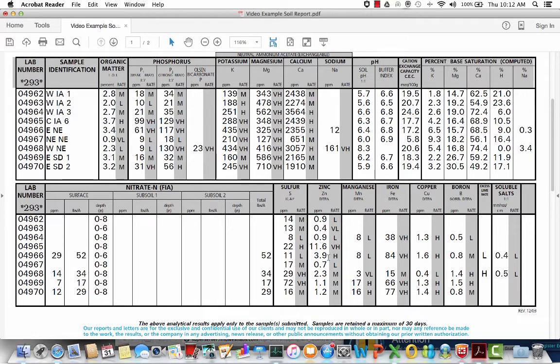All right, our 5th sample down here, this is the one that came from eastern Nebraska. Again, this is a field with pretty high fertility. We knew that going in. High organic matter, 61 on the P1, 117 on the P2, a good balance there, that 1-to-2 ratio, but very high fertility across the board. We knew it had high potassium numbers. So this one most likely has gotten good fertility in the past. In this case, it looks like they covered the zinc as well with a 3.9 part per million on the zinc.